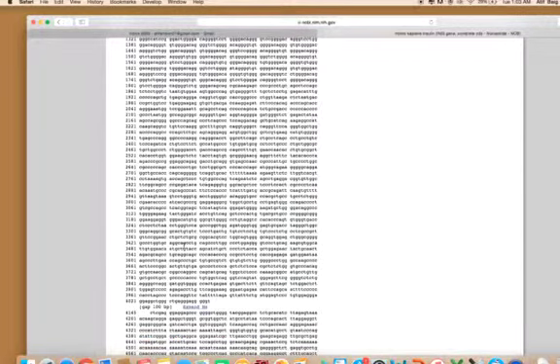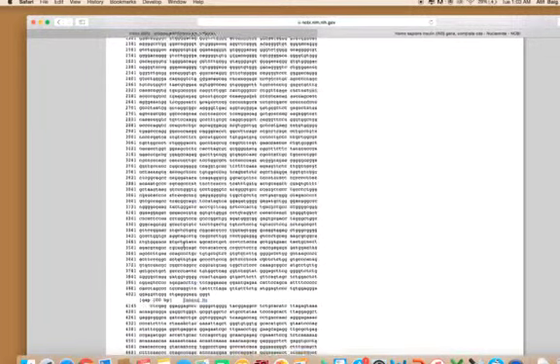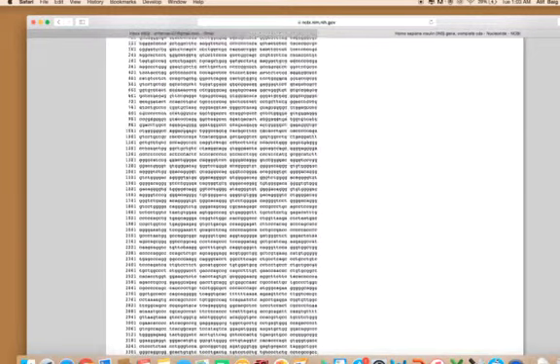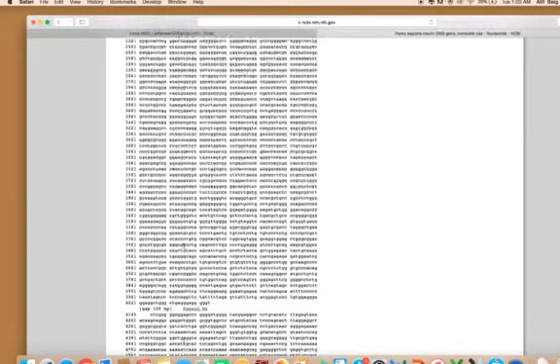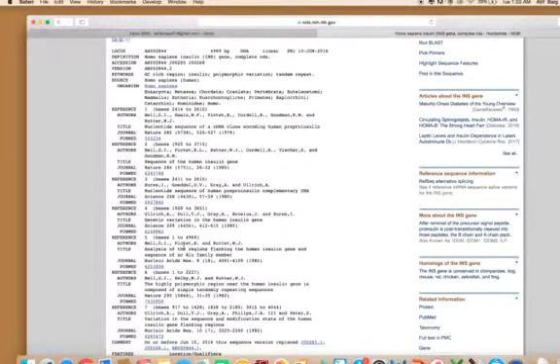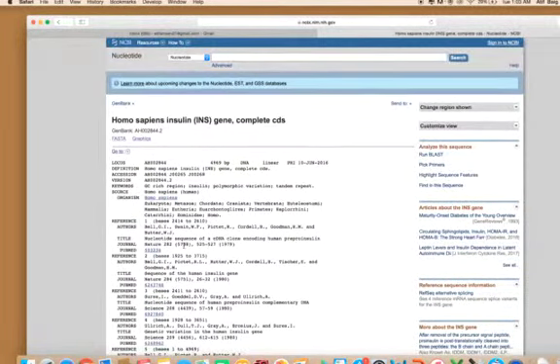Our topic is how to download this sequence starting from the first base pair and ending somewhere around 4000 to 5000 base pair, which is basically 4969 base pair. The sequence was released on 10 June 2016, so it's not so old a sequence. So we are going to download it.